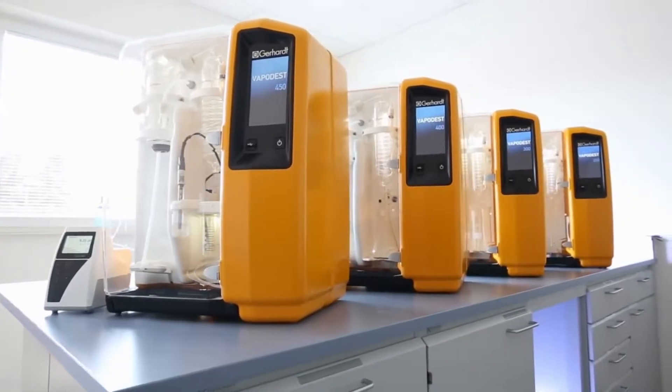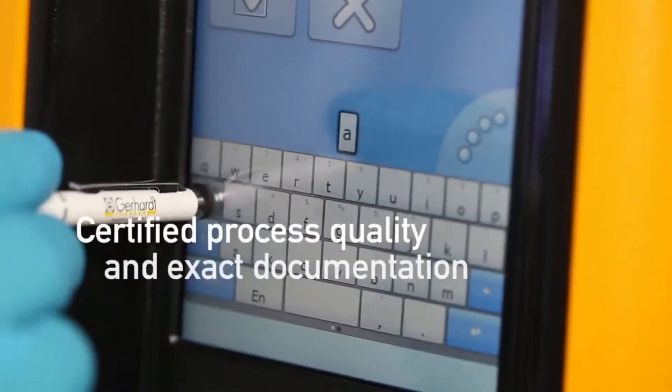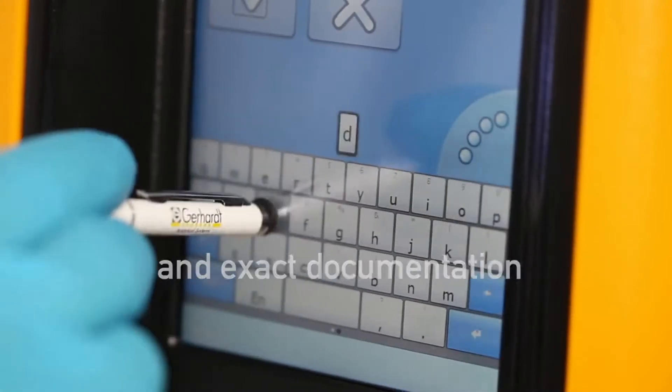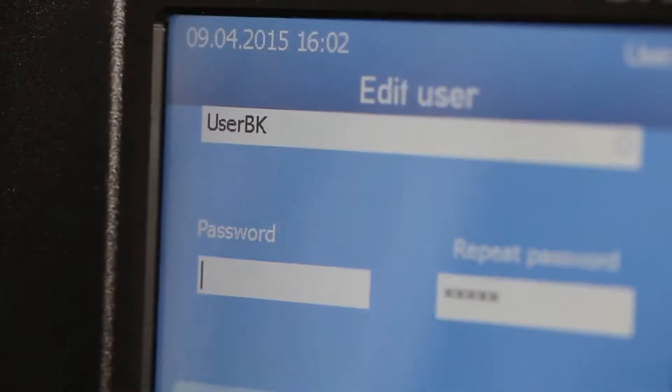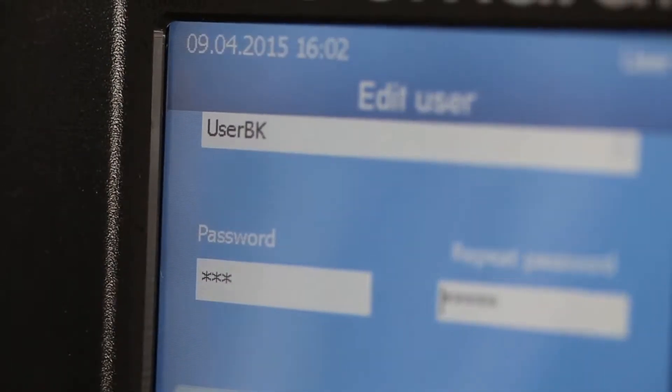Our new VapoDest devices now also do the laborious documentation tasks for you. All relevant user, process and device data required by accredited laboratories in accordance with ISO 17025 and GLP.